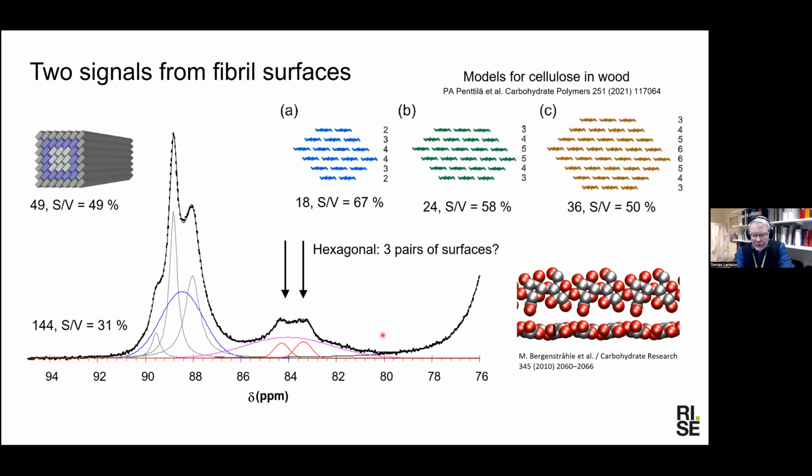And there have been ideas also about different shapes of fibril and different sizes. And this is from a rather recent paper in 2021 where they proposed this. And this is based on X-ray, but it's unfortunately based on X-ray alone, because if you take results from one technique, it can be, I would say that we need measurement results from several.